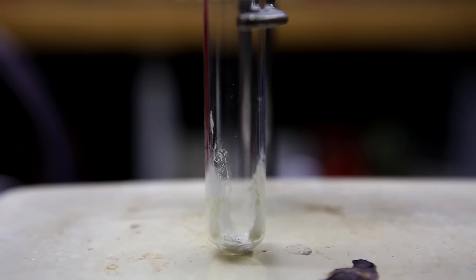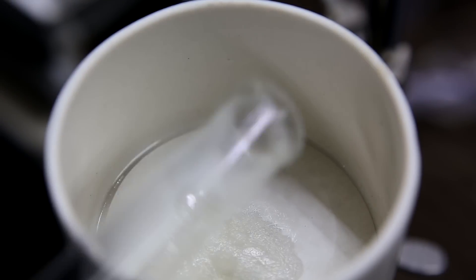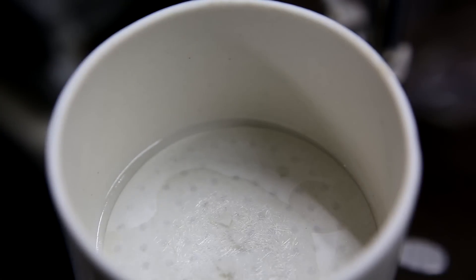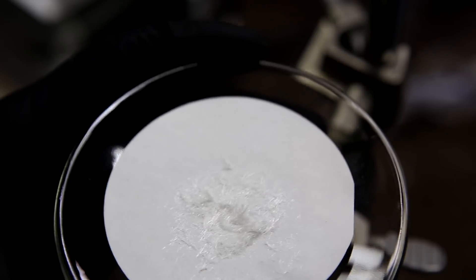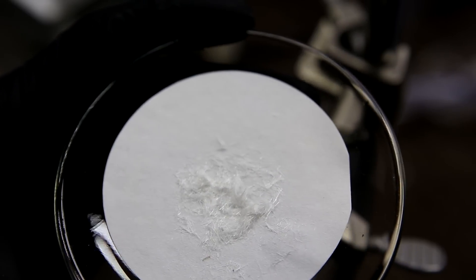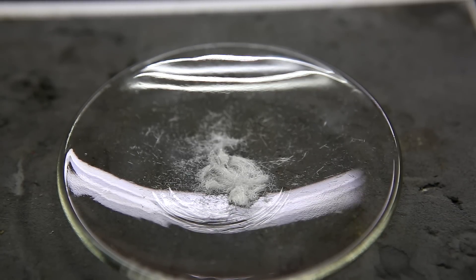The crude caffeine was then recrystallized using 95% ethanol. The crystals were vacuum filtered and the test tube was washed using ice cold 95% ethanol. The crystals were dried under vacuum and we were left with nice white, nearly pure caffeine crystals. Unfortunately the yield was quite low at only around 30 milligrams.